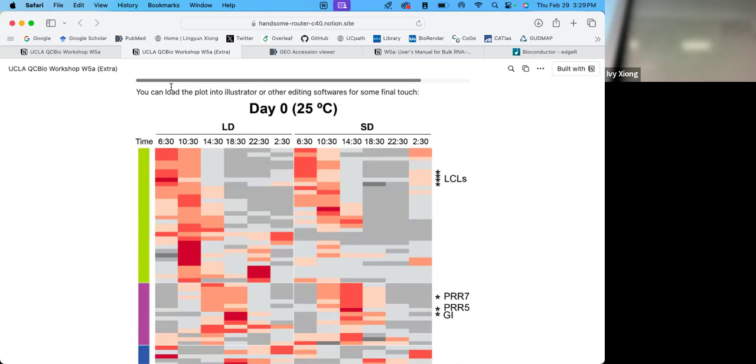Yeah. So when you run the R script, basically it's running the script for the specific gene. So then it provides us with the output for the same sample. I don't think it ran.